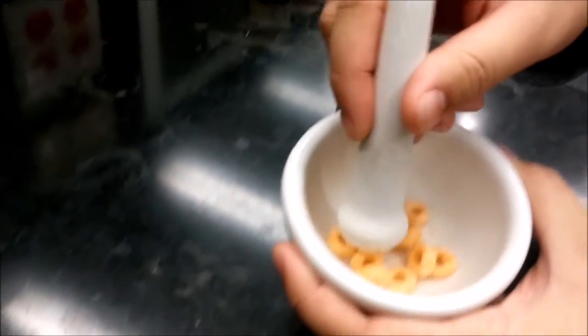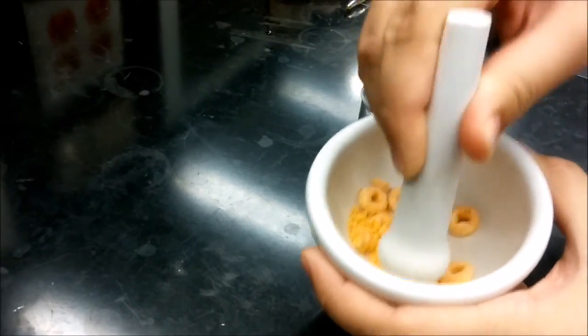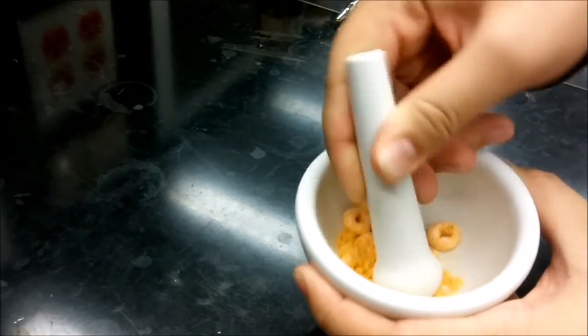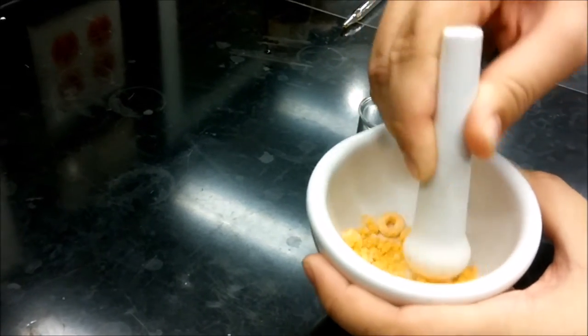Next, crush the Fruit Loops. You want them to be in as fine a powder as possible. This will allow for the most dye to be removed when filtering. It also helps to not clog the filter paper as you're filtering, which makes it go a little bit faster.